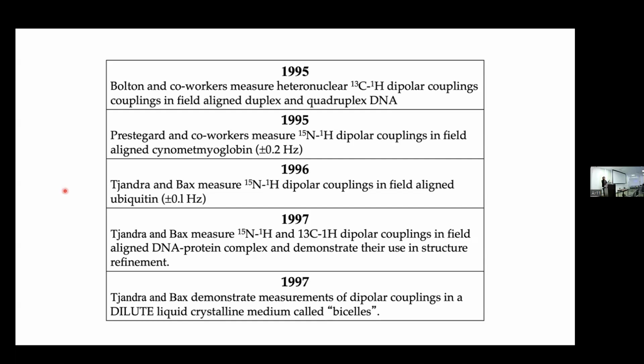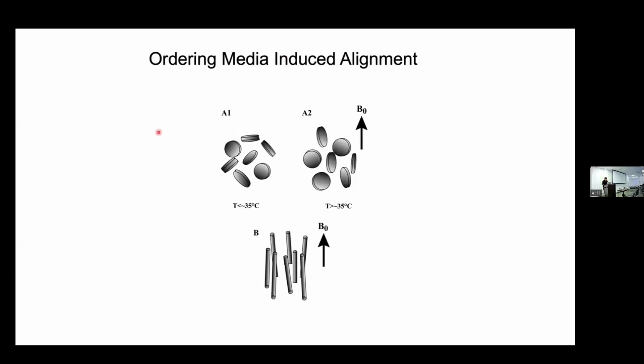When you take a protein and embed it, these bicelles, which are used to mimic membranes, will align spontaneously. If you add a protein in there, the alignment is transferred to the protein by mechanisms that we'll discuss. And you could tune how much alignment you have by varying the concentration of the bicelle solution. So this was really a breakthrough because now you could put in any macromolecule and measure these juicy RDCs that are 20 hertz large.